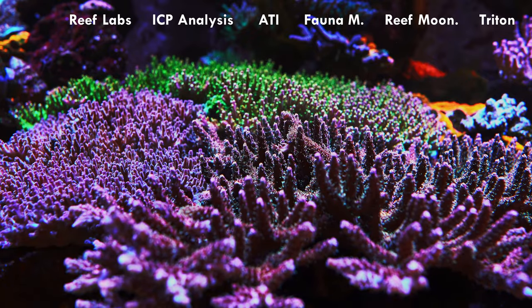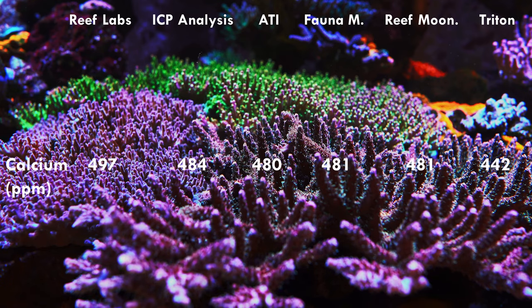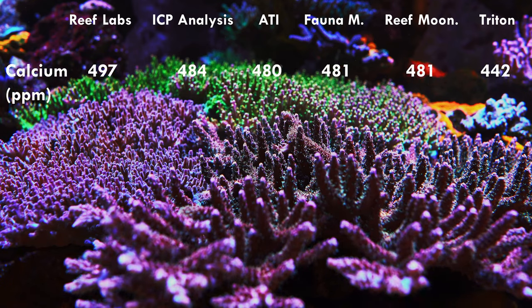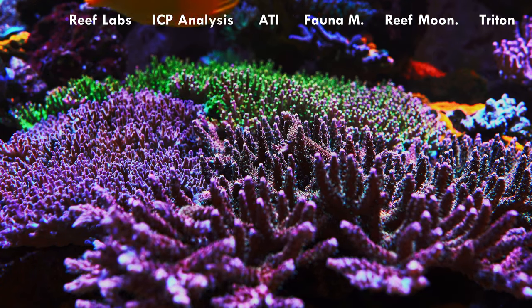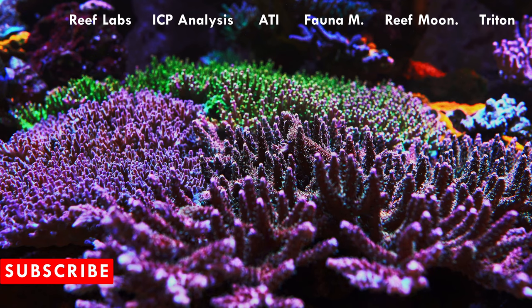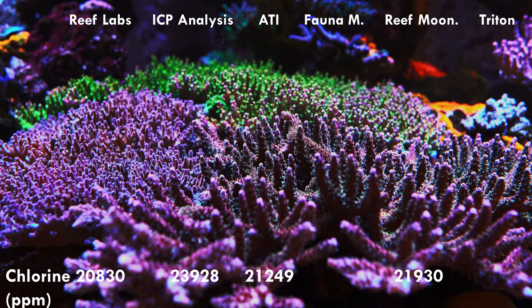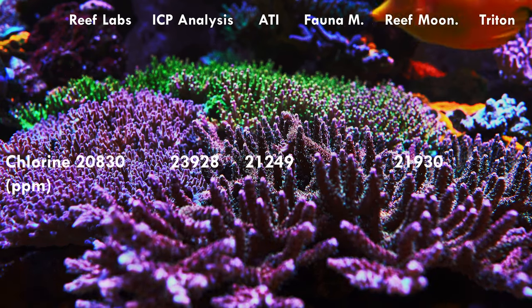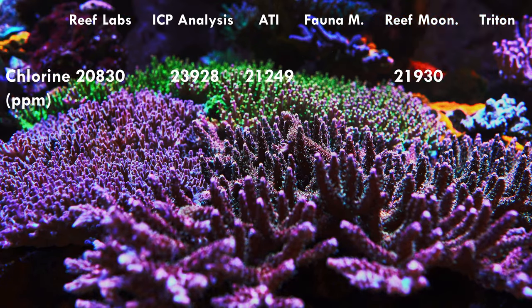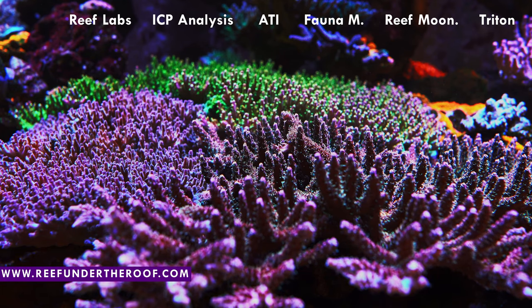My calcium is anywhere between 442 to 497 — all others are in between, optimal level. It's a little elevated, but I dose kalkwasser and All For Reef and my calcium always tests around 480 with my test kits, which aligns with what the ICP companies are telling me. Not all ICP companies test for chlorine, but the ones that do agree it's somewhere in the 23,000 to 24,000 range — elevated, so just do a water change. My potassium: I dose potassium nitrate and I do know my potassium is a little higher than most tanks. The lowest value is 406 and the highest is 467 from Fauna Marine — all others in between, all good.